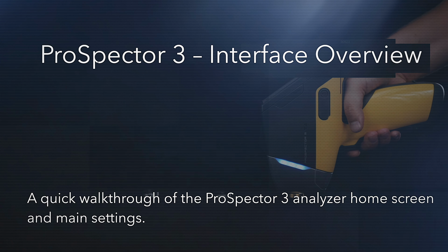Also here you have the remote control. You can connect to the device via some special programs, VNC or a similar remote display, and you can totally control the device. You can make measurements remotely. But your laptop and the analyzer should be connected to the same Wi-Fi network.